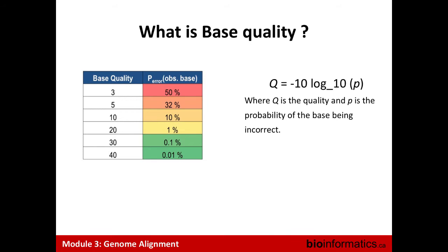Sorry, is that fourth line the ASCII value of the average for that sequence? No. It's for the read, so for the cluster that has been seen. From the cluster, one base has been called for each cycle, and it's the quality of that base. So that's all in the fourth line? Yeah. For one sequence, so for one cluster.